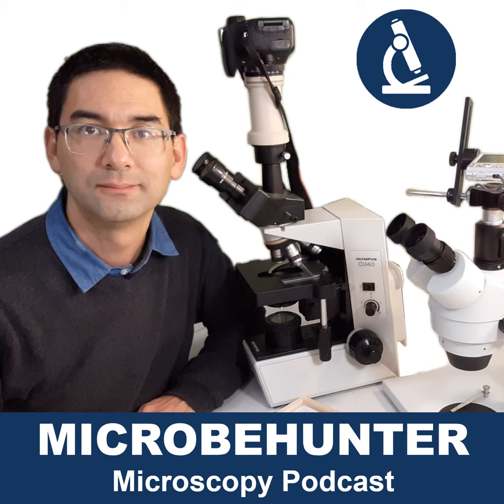I compare the whole issue of magnification a little bit with regular photo cameras. It's a little bit like, if you want to buy yourself a camera, asking, well, which zoom lens do I need so that I can take pictures of my cat? Okay, with all of the cameras you can take pictures of your cat. There are other things that are important. I don't know, the intensity of the flashlight maybe, or how heavy the camera is, or the resolution of the sensor. You see, it's not really the case that the optics are limiting in any way. So that is the analogy that I sometimes like to give you.